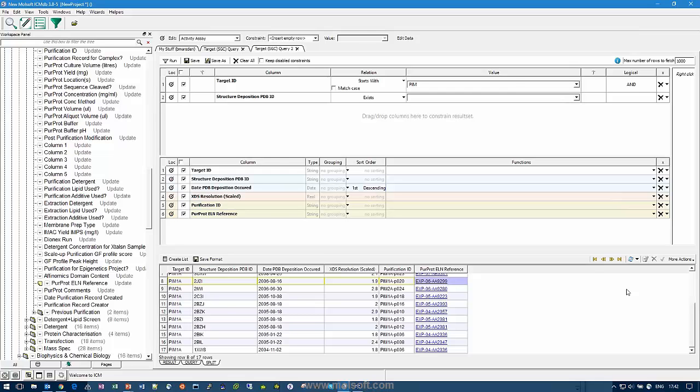Next question. There are some people from SGC. The question is more of an internal thing, but can they view these databases from other sites at SGC? Yes, and I will take that offline. I assume this is the guys from Brazil. I will definitely take this offline with you guys. There's something called Global Hive that I will discuss with you separately.